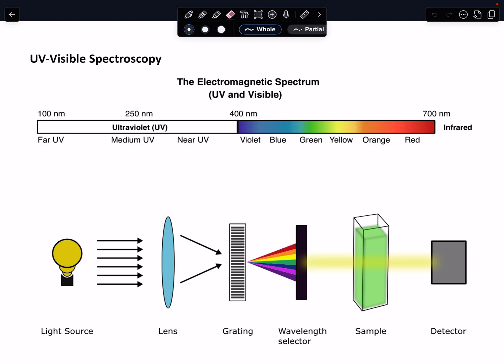Okay, so let's start with this spectroscopic technique compared to IR. Here, the energy of the radiation is greater than what we see in IR spectroscopy. Generally speaking, we're moving from around 200 nanometers, and sometimes it goes all the way down to 800 nanometers, which is closer to the IR range. Some techniques focus on far UV, so they can go a little bit higher. Some focus on near IR, so they go a little bit lower.